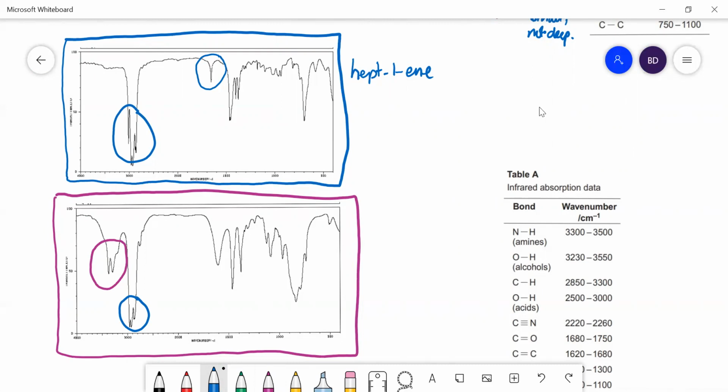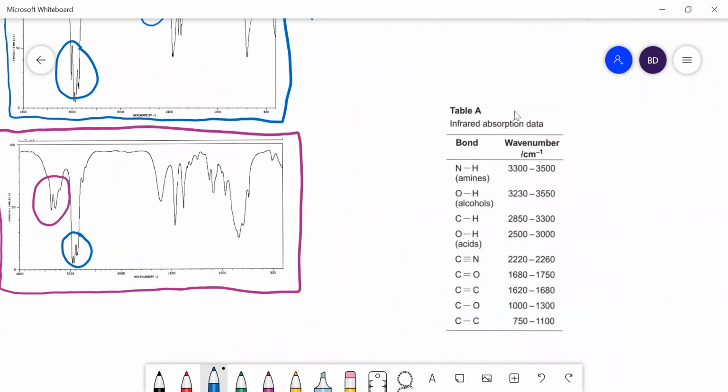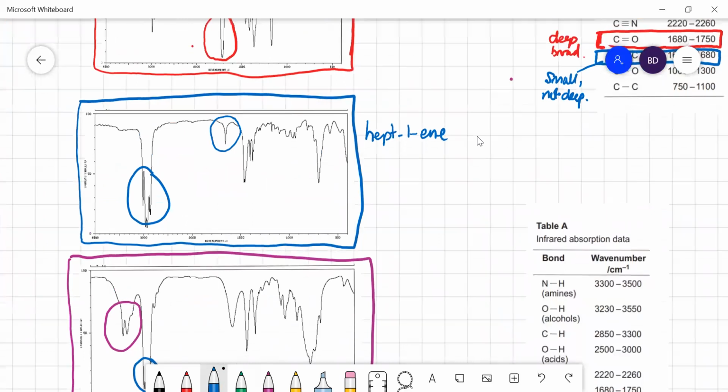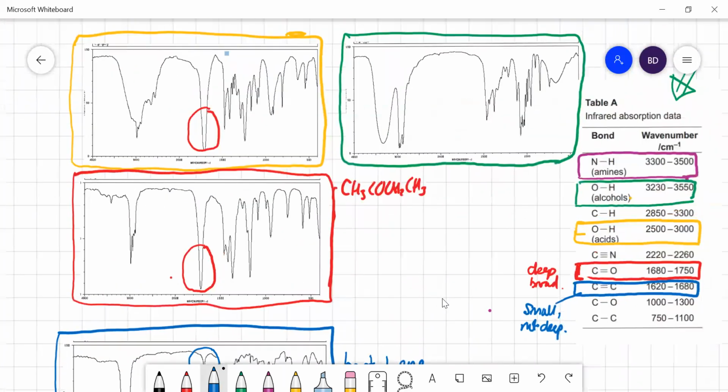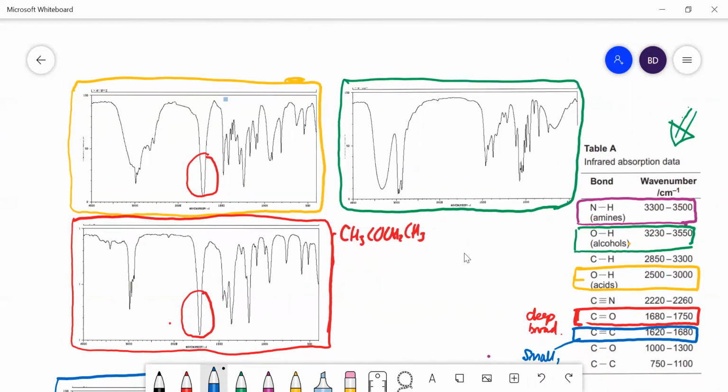So if you get all those sorted in your head, the shape of them, then you don't have to worry so much about wasting time looking at your AQA infrared table, because you can tell without referring to the table. You should be able to just say, right, that is an alcohol, no problem. That is a carboxylic acid. That's a carbonyl, and so on, just by looking at the shape of them. Right. Don't forget about the fingerprint region for infrared as well. And that is about all.